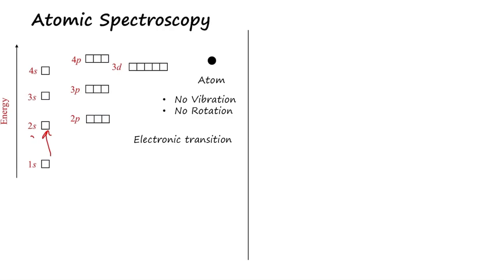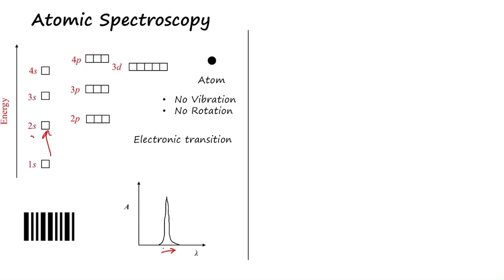Because these transitions are sharply defined, each atom absorbs and emits light at very specific wavelengths. This is why an atomic spectrum looks like isolated, razor-thin lines, almost like the element's barcode. These lines are so precise that even tiny concentrations of an element can be detected.